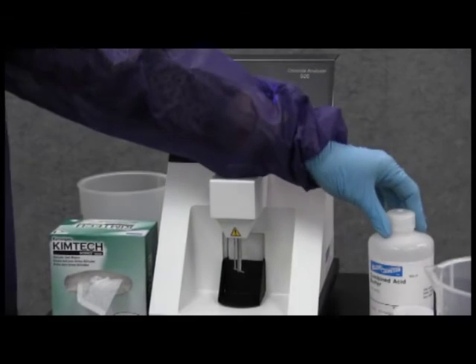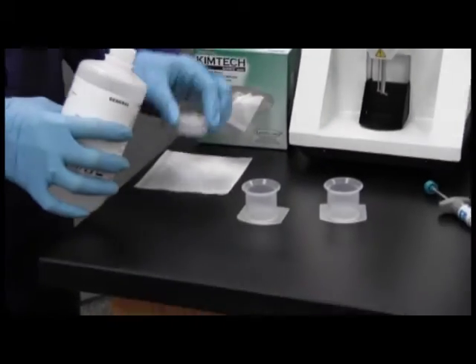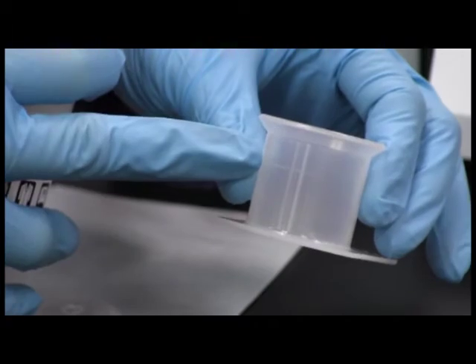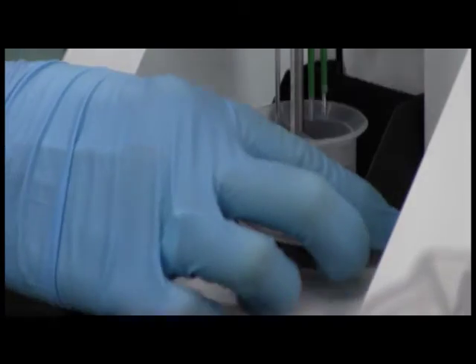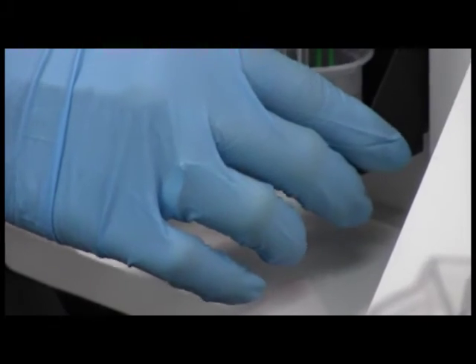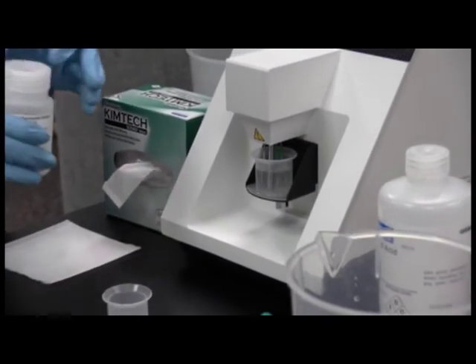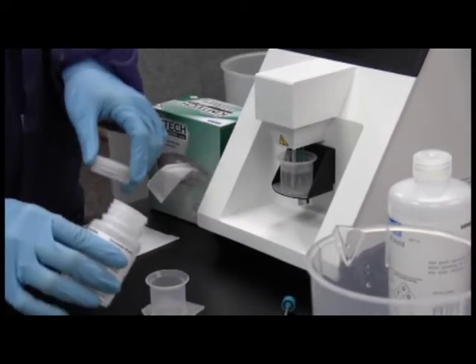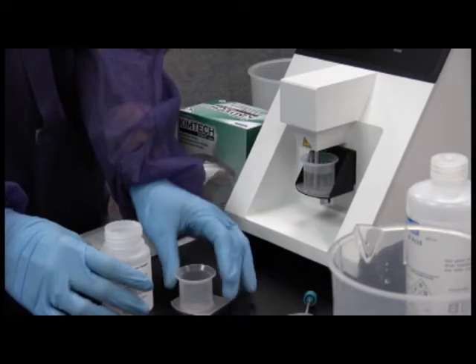Pour approximately 14 mils combined acid buffer close to the scribed line on a clean beaker. Place on the lift of the analyzer and raise to the full-up, locked position. Pour a small amount of fresh 200 milligram per liter chloride standard to a clean beaker, swirl, and discard to waste.